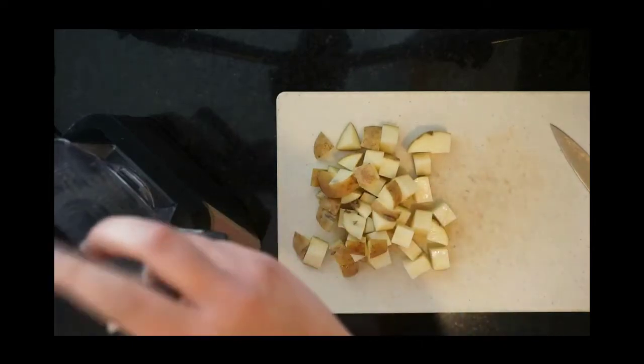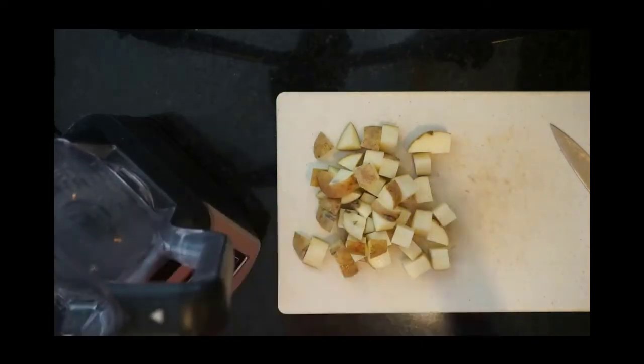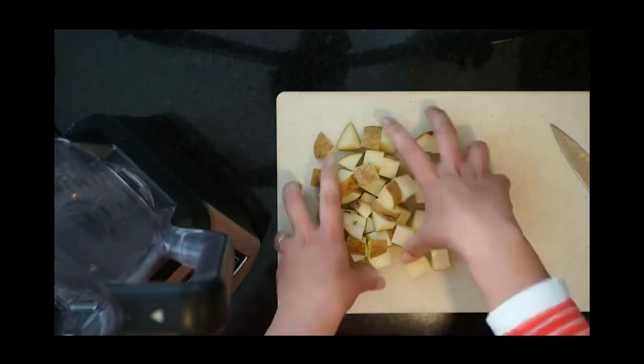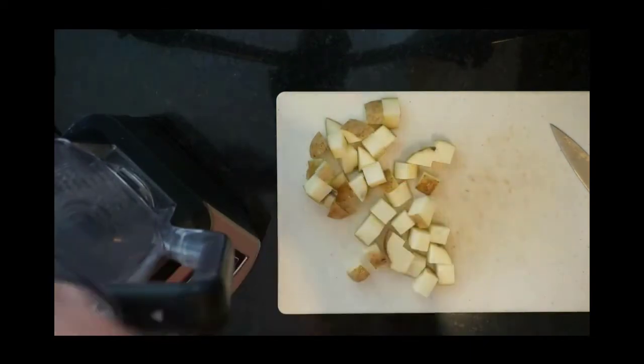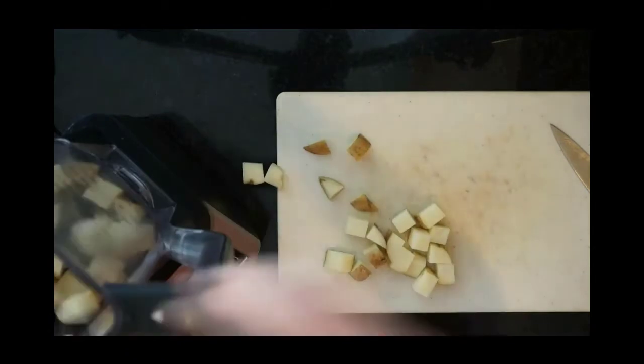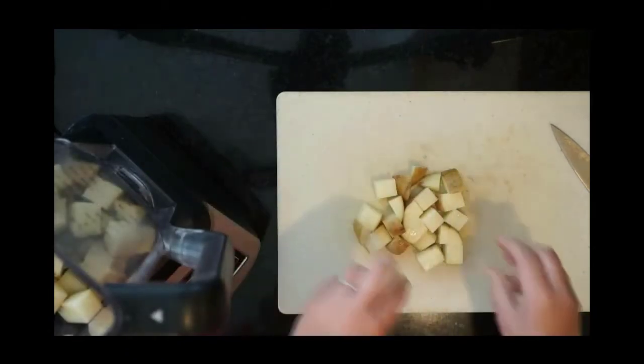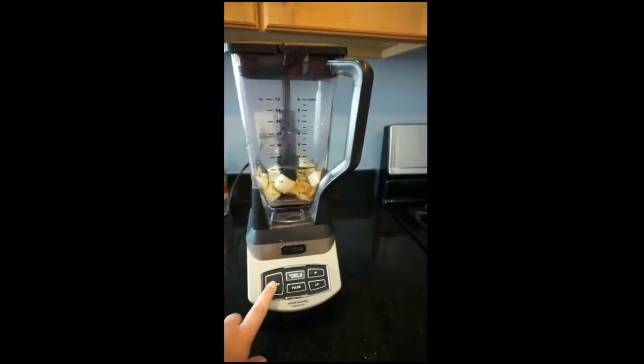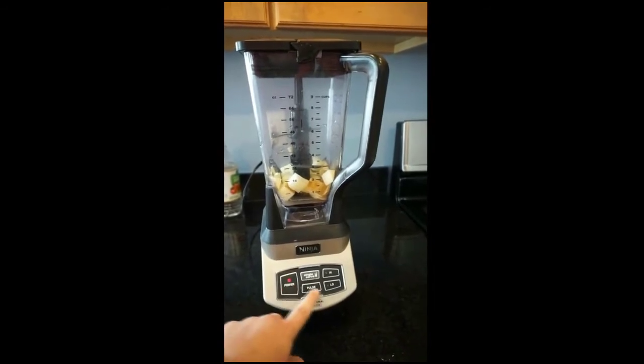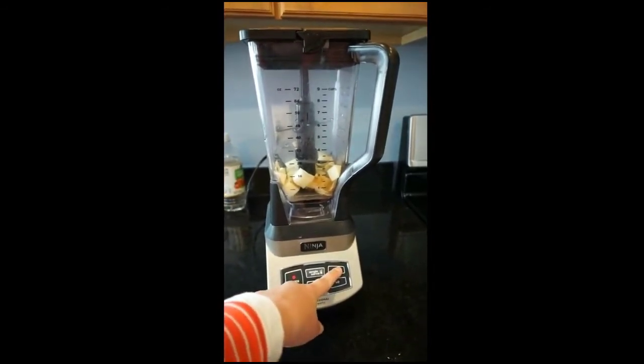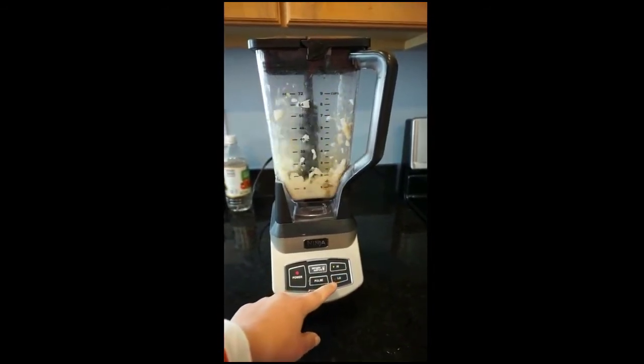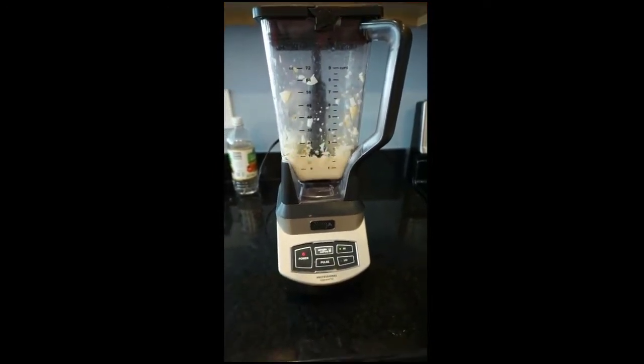Then we'll put half of those into our blender. The directions tell you to blend until it looks like oatmeal, so you can watch to see what that consistency is.